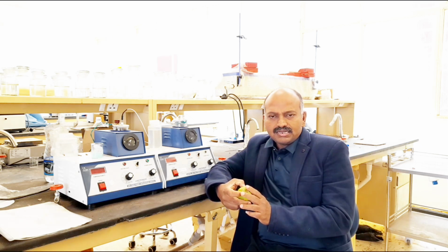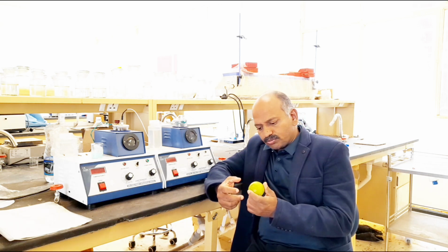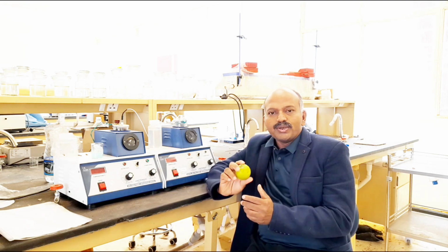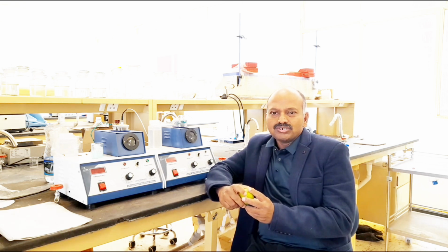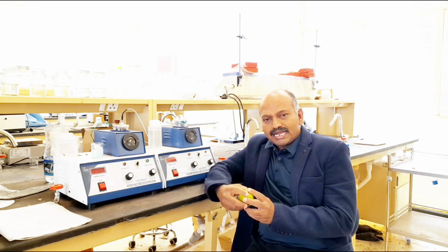The chemicals required in this reaction are the 0.1 molar sodium hydroxide solution, which is to be prepared separately, and then the lemon juice. How to make the lemon juice: we have to make it before the experimentation. That is, we have to cut it into two halves and squeeze the juice into the beaker, and then remove the solid particles which are not dissolved in this juice. After filtration, we get the filtrate, and that filtrate can be used for the experimentation.